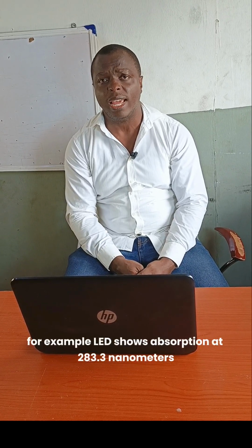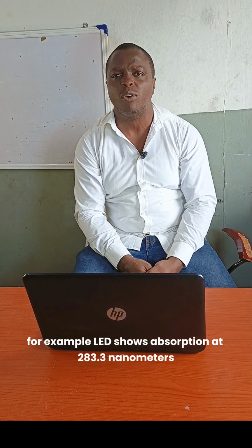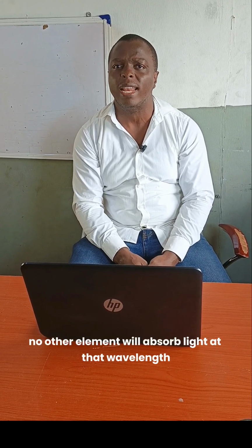For example, lead shows absorption at 283.3 nanometers. At this particular wavelength, no other element will absorb light.